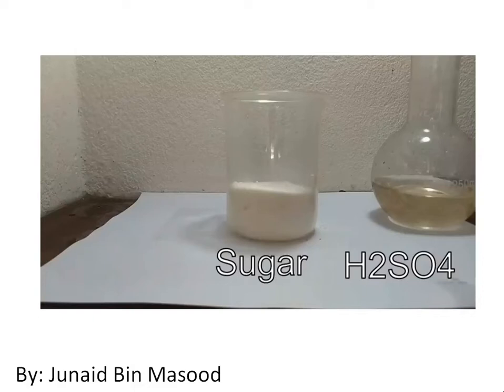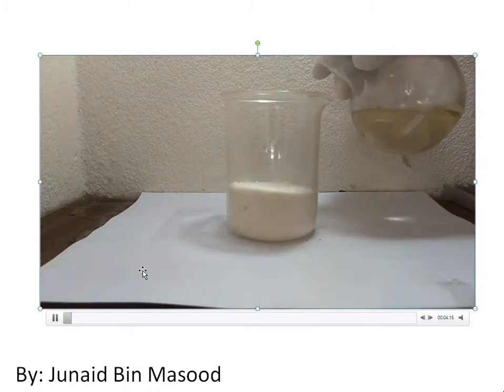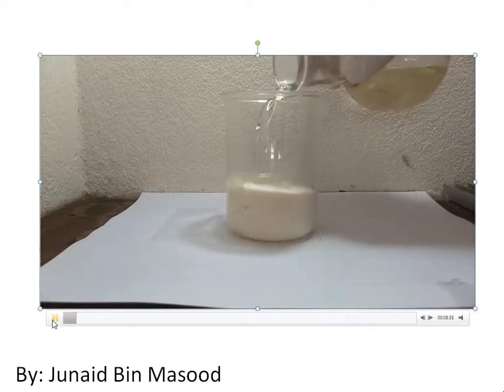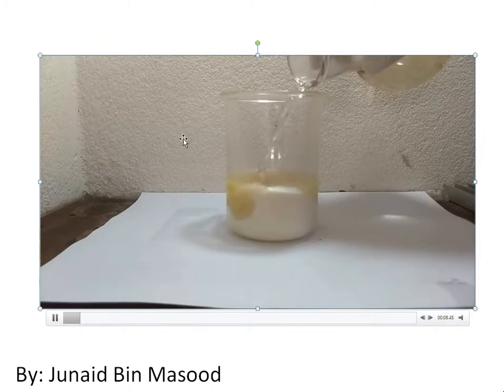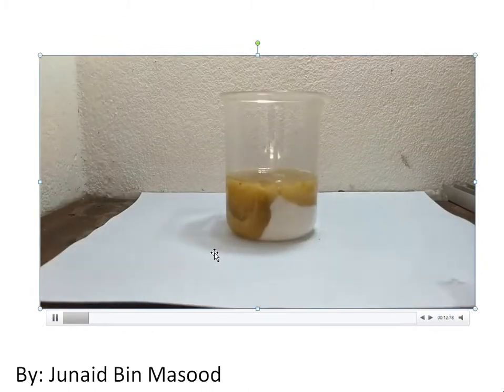Some more chemical reactions. We are going to basically mix sugar and sulfuric acid. This is a very interesting experiment actually, but if you're trying to do this at home, please be very careful. Don't do this without any elder support or under supervision. You just have to perform. So we are adding sulfuric acid to the sugar.